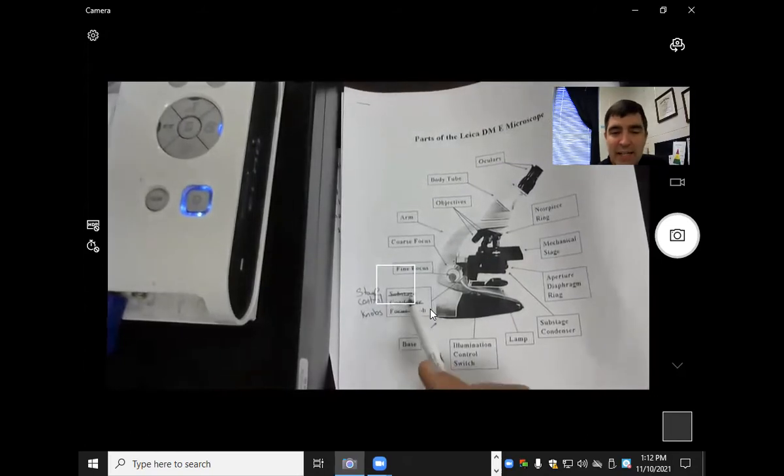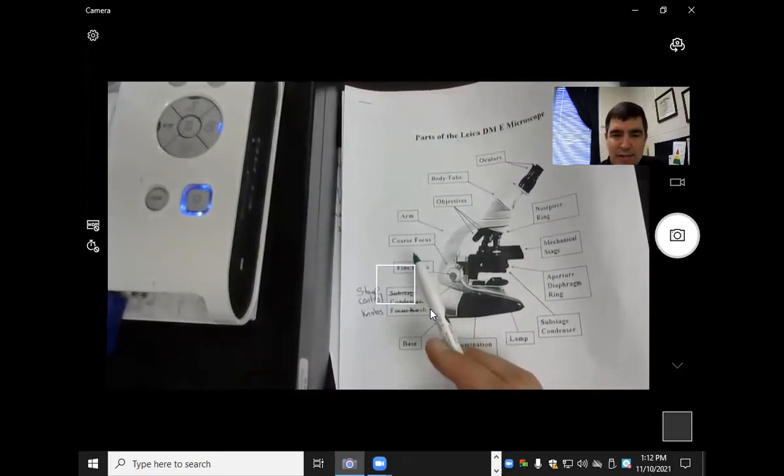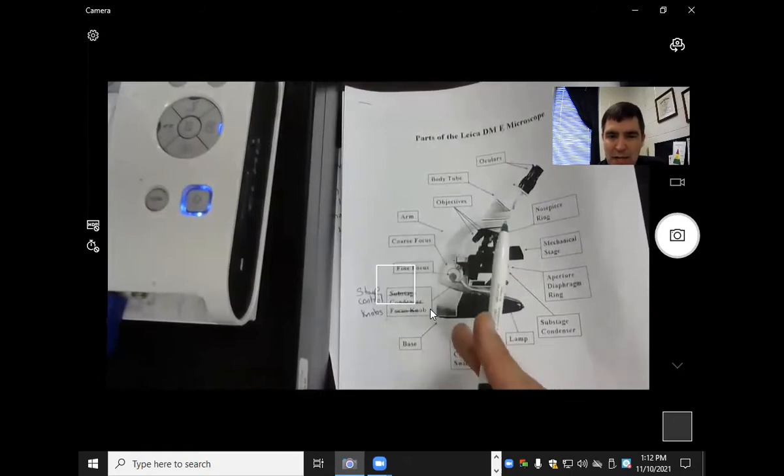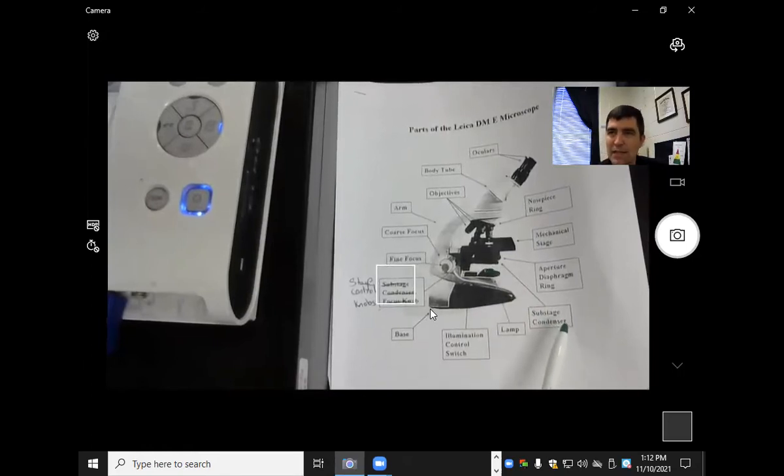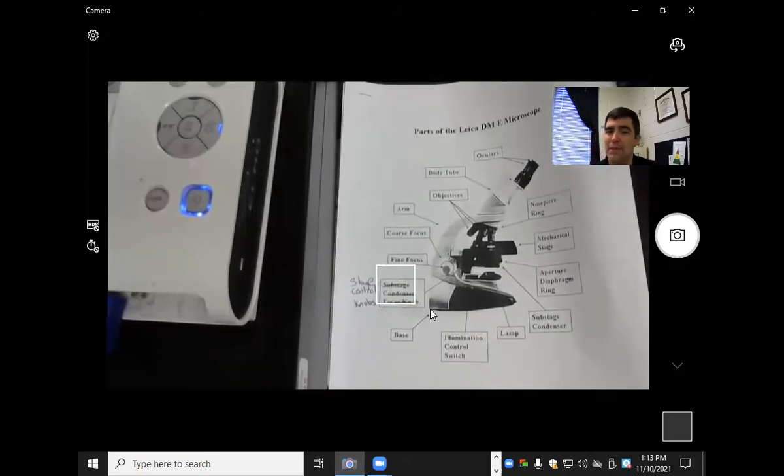We have the fine adjustment or fine focus, and the coarse focus on the outside, the arm, the objectives, the body tube. That part is called the substage condenser — sub means it's below the stage, and it's a condenser that affects the light a little bit.